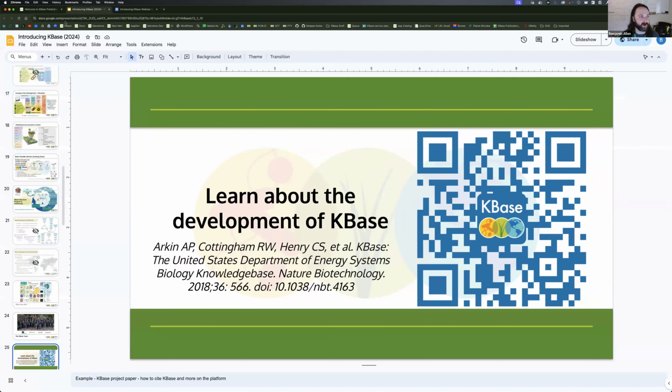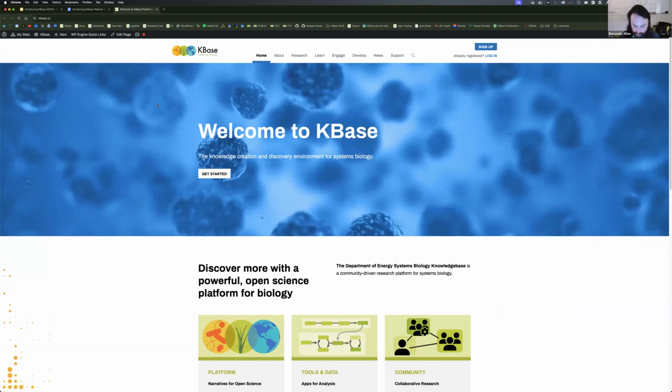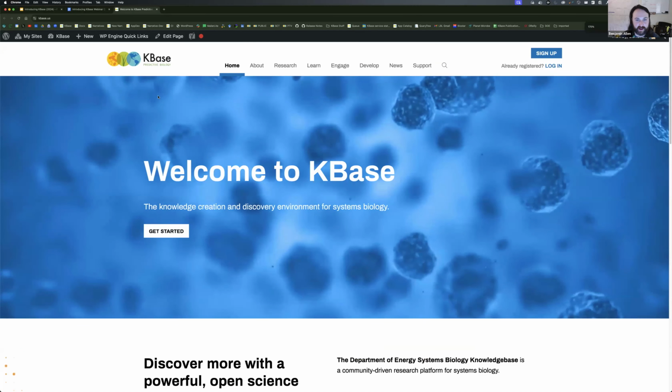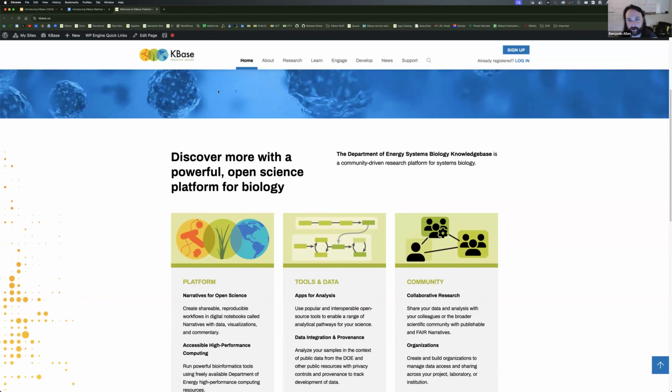All right, so I am going to go ahead and start with the proper demonstration of the platform here. To get to KBase, you go to kbase.us here, and you'll see some basic information similar to what I've already shown you on our homepage.